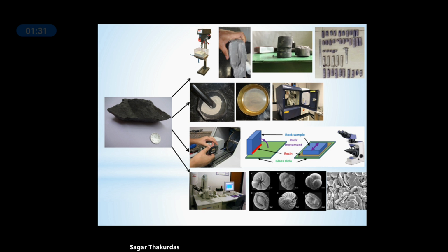So since the formation is shale, which is fissile and fractured, it was really difficult to extract the intact core plugs. And in the last picture on the top, you can see a number of core plugs which were derived from other shale samples. So this particular shale was fissile and fractured, therefore we could get only fractured core plugs, but from other massive shale formations we have derived intact and cylindrical core plugs, which can be seen on the extreme right hand side figure on the top. So this was done to find the porosity and permeability of the shale.